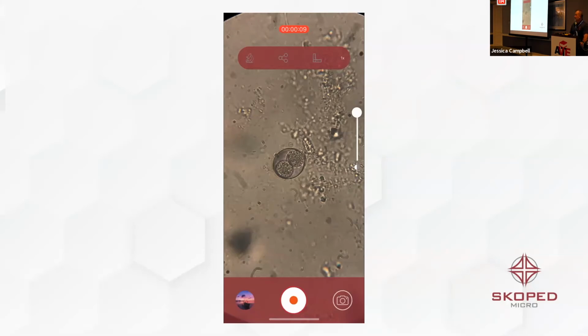And it's a skill that will help the technicians that you guys are teaching. The thing about it is, this is a very inexpensive thing to have. Anybody want to guess what a phone case and an eyepiece adapter costs? And if you went by my booth, don't guess. Anybody? $25? Wow, that's a heck of a deal. So you can't work for me, by the way. So the whole setup is $199. That's what it is, less than $200.